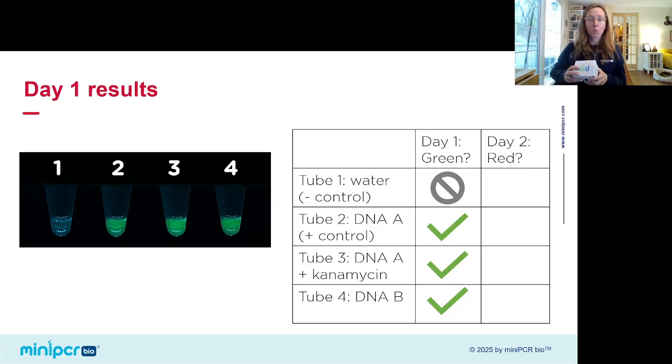Great, okay. What about day 2? Our second time point, or I guess technically our third time point, is when we assess translation. Now, cooking show style, I have some tubes that I set up yesterday so you can get a sense today of what our samples should look like. So I'm putting those in my P51 now. Turn my slides off for a moment. And I'm going to show you what my day 2 samples look like.